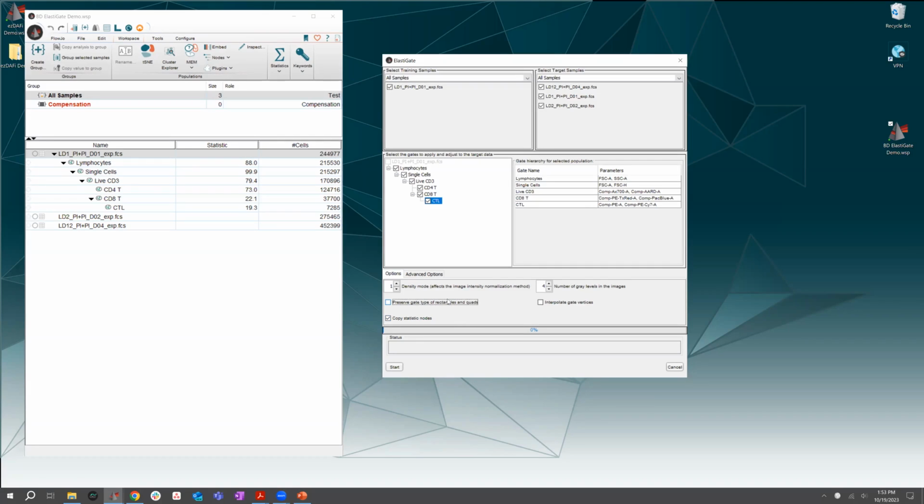A quad gate divides the plot into 4 sections with just a straight line across and down. So you're restricted with a gate type like that because you can pretty much only nudge it so much, and you can't really change the shape of it. If you turn this off, you give the algorithm a chance to override a quad gate and turn it into something like a polygon, and really make it a bit more of a free form shape.